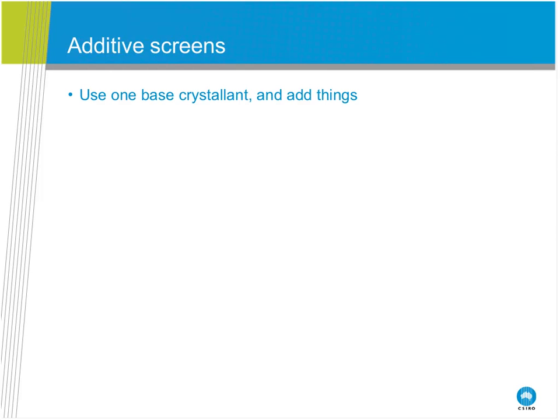Additive screens. Additive screens we use a lot in C3. We find them phenomenally useful. We have the Hampton additive screen, we have the OptiSalt additive screen, we use a detergent screen, we use silver bullets, and we have an ionic liquid additive screen, which we use. They're all good. But if I had to just choose one, I would probably go for the Hampton additive screen.